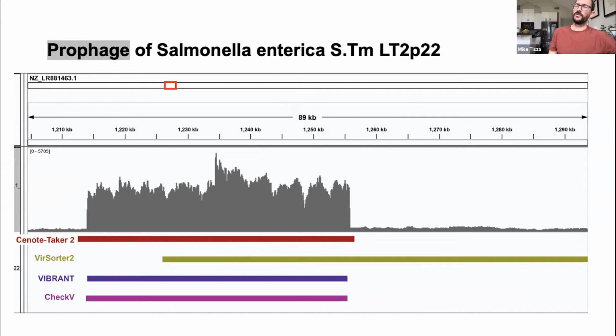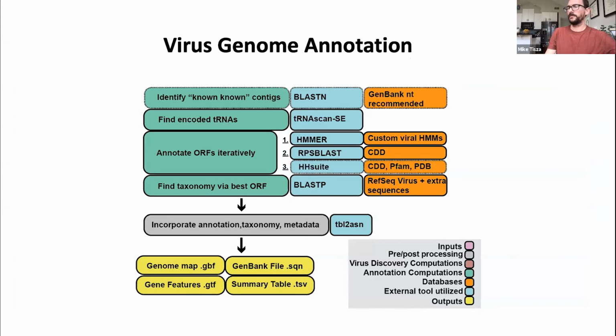This is just 2 little examples, and really to get any sort of meaningful qualitative or quantitative measurement, we would have to look at a lot of these. But I do think it's important to look at these, and you can see that if you look at different genomes, different tools will perform slightly differently. And so when you're doing your project, it can be important to compare the different calls that you get from these different tools.